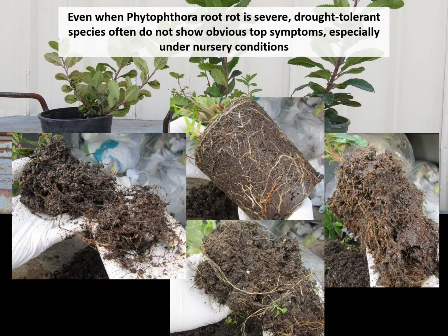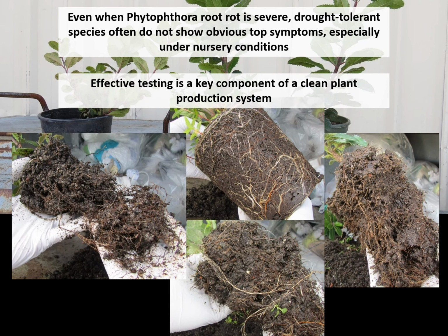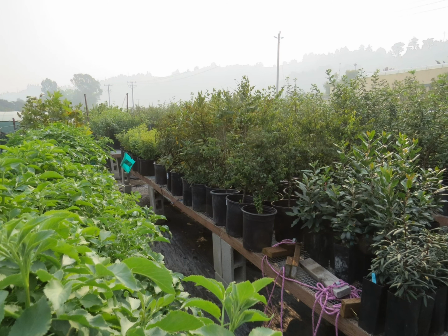So the issue here is that we can have even very severe disease and not be able to see it from top symptoms alone. Because of that, we need a really effective testing method that doesn't rely on simply looking at roots and trying to isolate from them. Because when we get into a situation where we have many plants, many of them large, many different batches, etc., we simply don't have the resources to be pulling up each of these plants and looking at the root systems and trying to determine whether the roots might be dead due to the fact that they were allowed to dry out a little bit, or whether they're dead due to Phytophthora.